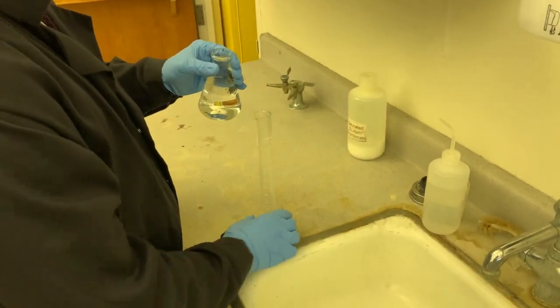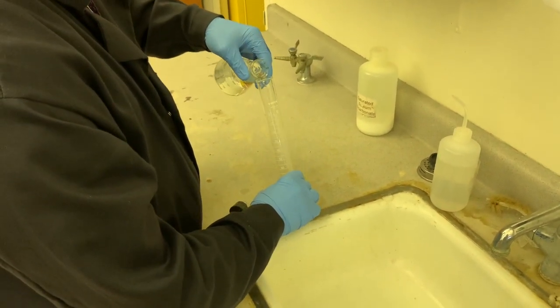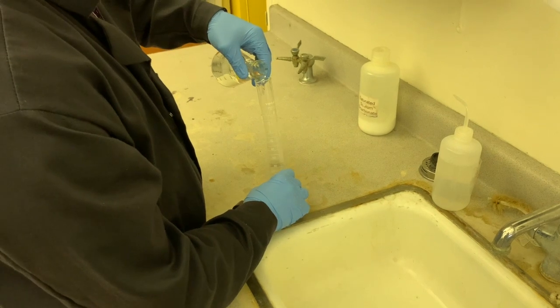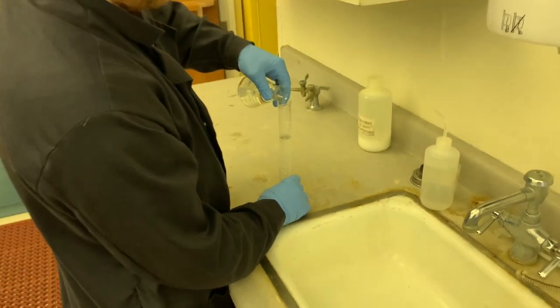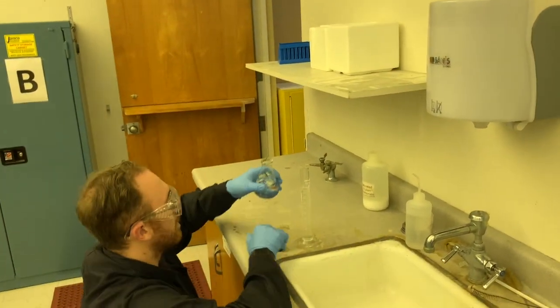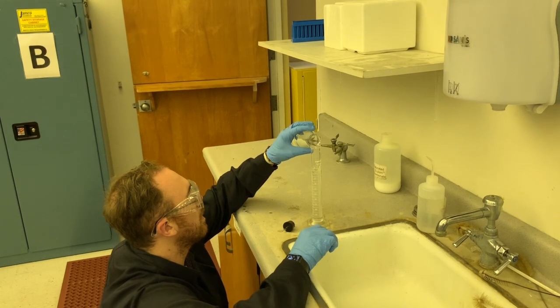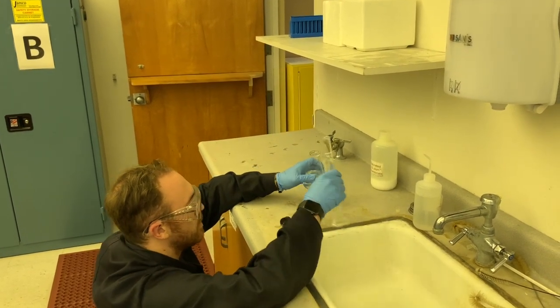And do a couple rounds to figure out how much volume we've got here. Don't want to lose any milliliters there. Fill it up to the first 100 milliliters, as close as possible. So that's 100 milliliters.